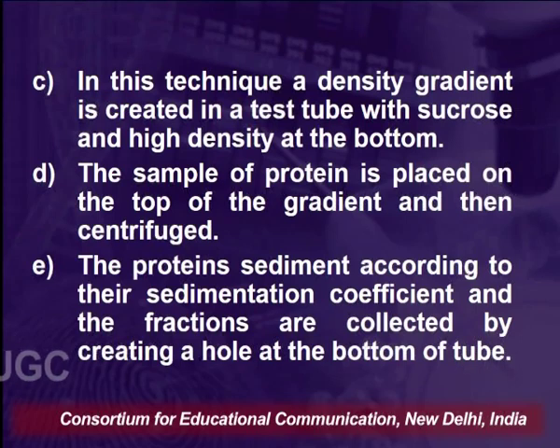Whenever we are doing this kind of experiment, we place the sample on the top. The proteins sediment according to their sedimentation coefficient and the fractions are collected by creating a hole at the bottom of the tube. That is mostly used when we are working with proteins. In such cases, we make a hole at the end of the tube and then we can collect the sample at the bottom.